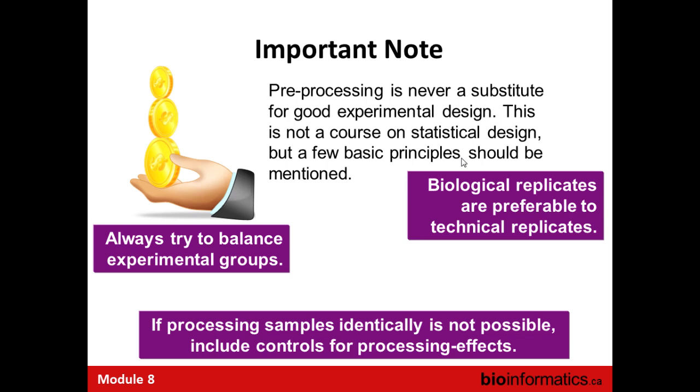And I can use those to assess just how big my batch effects are and what kinds of batch effects I have. Can I somehow mitigate or remove them? In fact, you might even run those 20 samples first thing, before you run the other 980 samples in year two, to get your assessment of whether we have any hints that there are large batch effects. If they're really large, maybe I should redesign my experiment or go back to genomics and figure out where they come from.